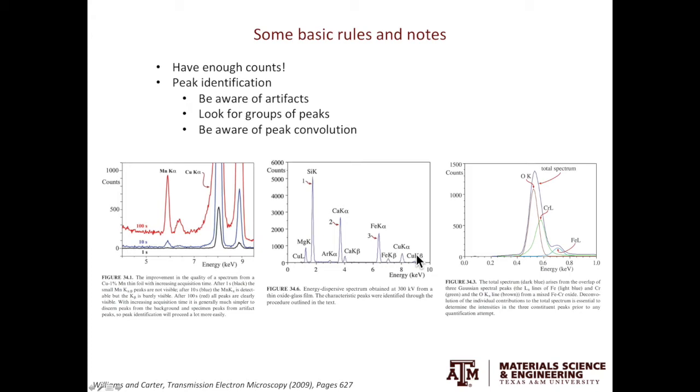For example, if you see a peak in the position of calcium K-beta, but there's no calcium K-alpha peak, most likely this peak is from an artifact. The third thing is, when you don't see a peak, it doesn't mean it's not there. It is especially important in X-ray peaks less than 1 keV.